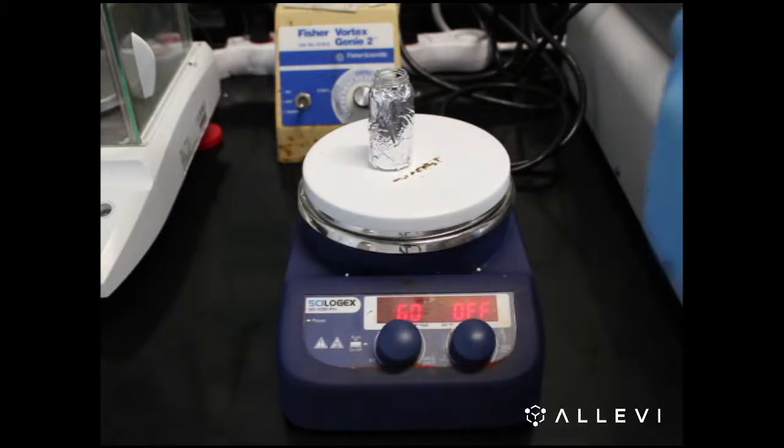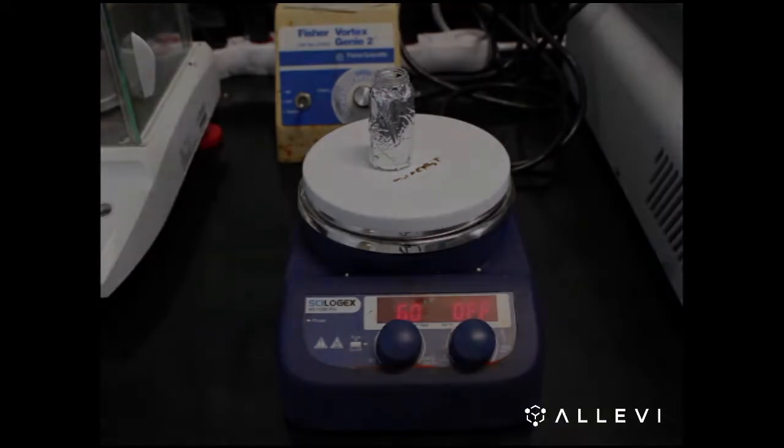On a hot plate at 60 degrees Celsius, add 10 mL of distilled water to the LAP and allow it to dissolve for 20 minutes.